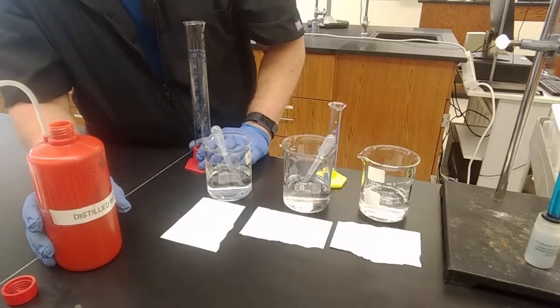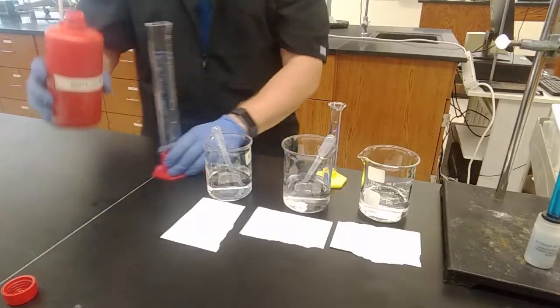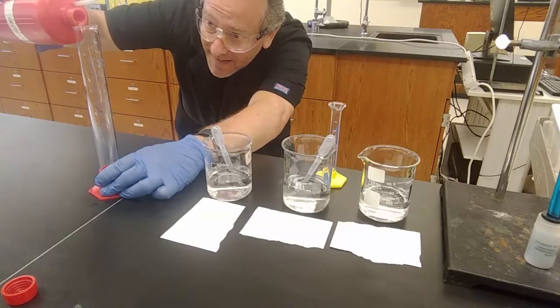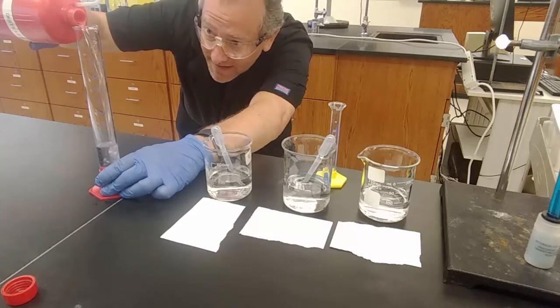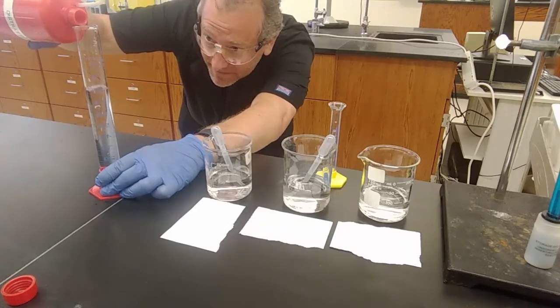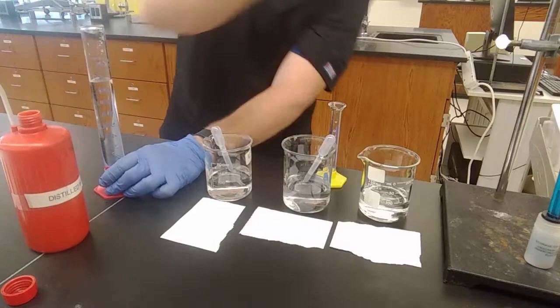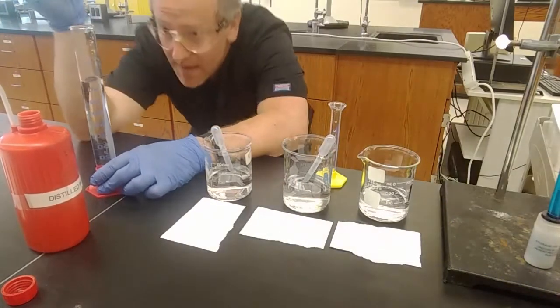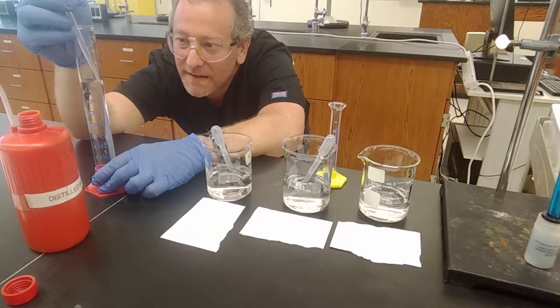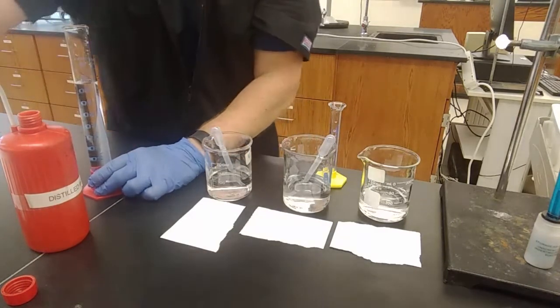Next, a 10 times dilution again, so 90 milliliters of water, rather. Again, making the solutions in this lab takes longer than actually doing the lab. 90 milliliters of water.